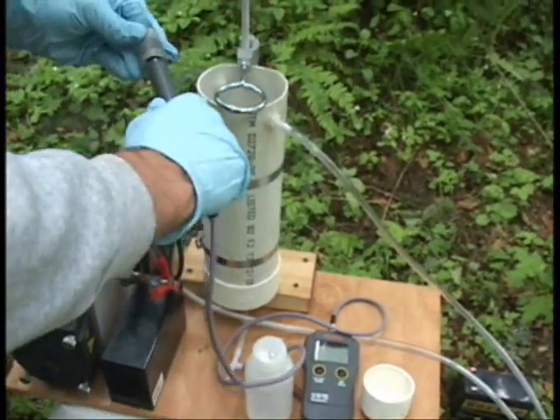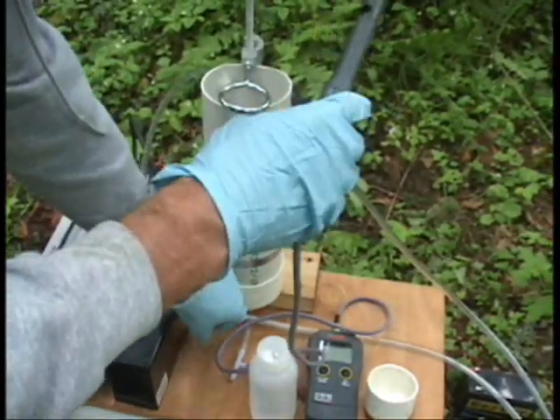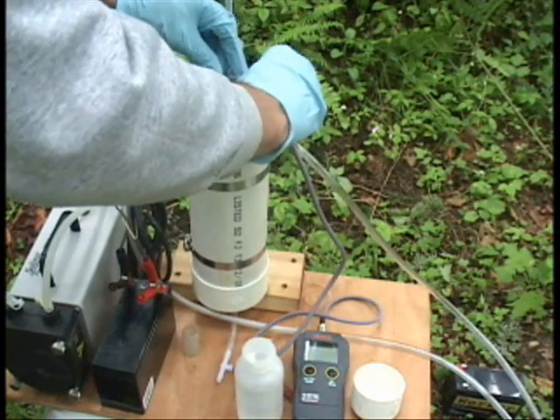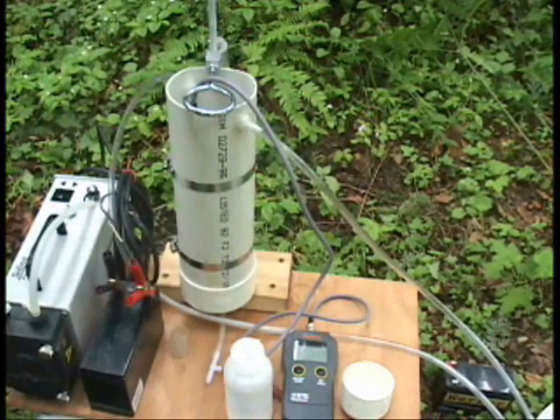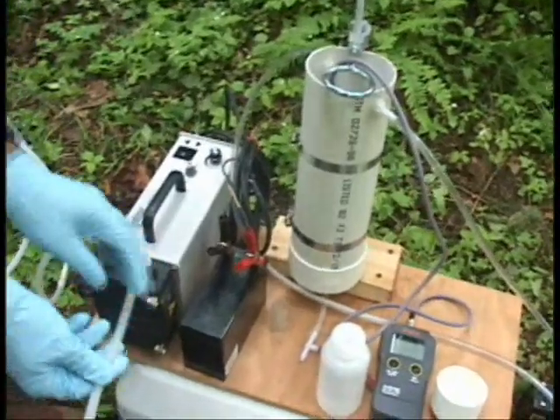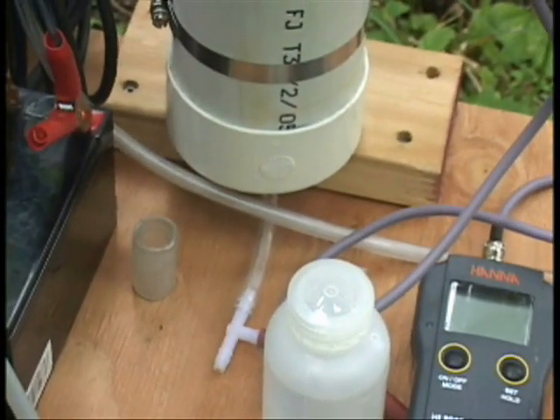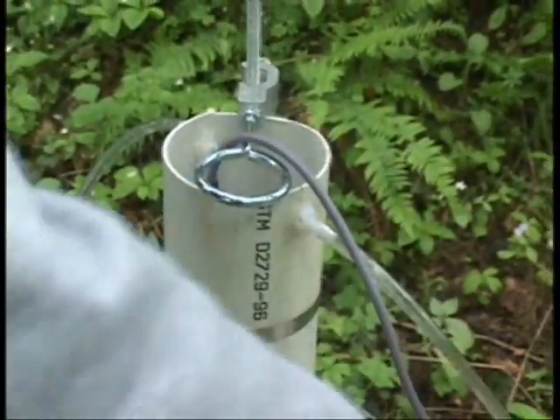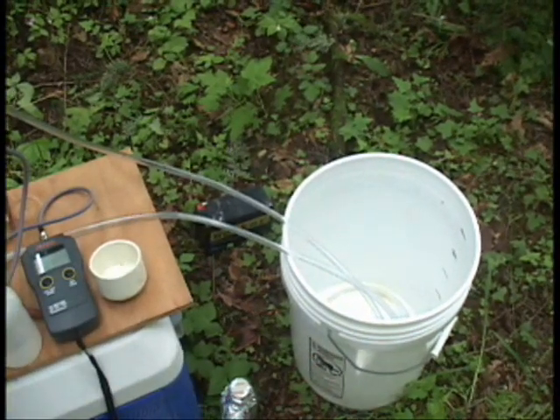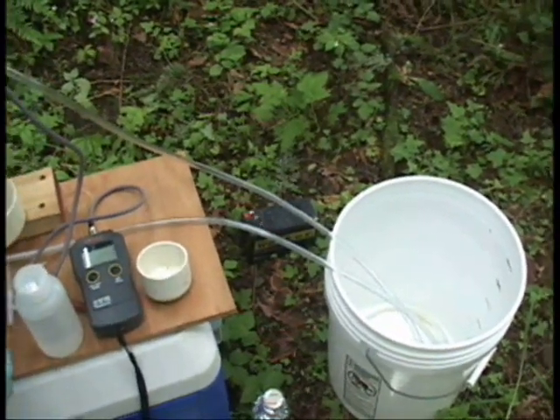This is our multi-parameter probe that we're going to use to measure pH, temperature, and conductivity while we're purging the well prior to sampling. The discharge end will be hooked to the flow cell here. Water will move up through the flow cell, past our probe, and then discharge into a bucket where we've marked the volume in gallon increments, so we can keep track of the well volumes discharged during purging.